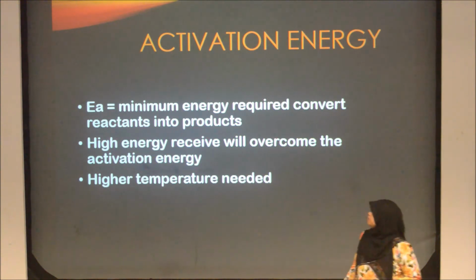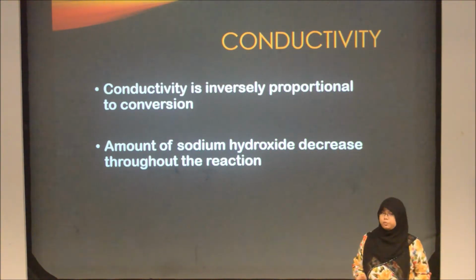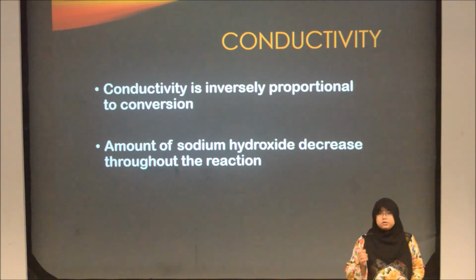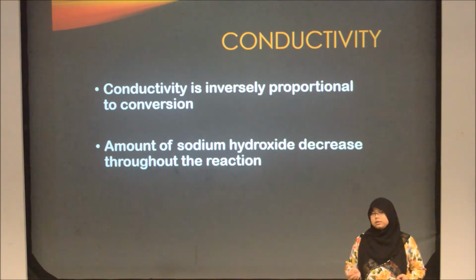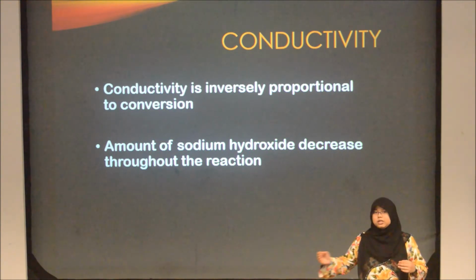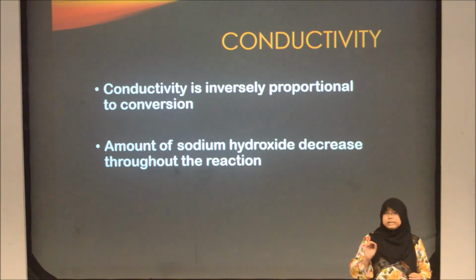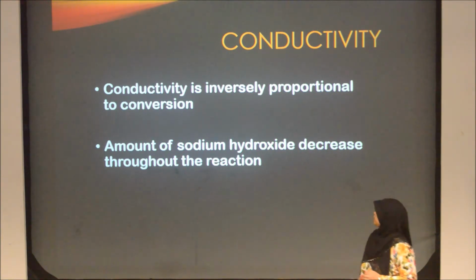Moving on is the conductivity. Conductivity is inversely proportional to conversion. This is because sodium hydroxide is a salt that will ionize throughout the reaction. So throughout the reaction, the concentration of sodium hydroxide will decrease, so the conductivity will also decrease.